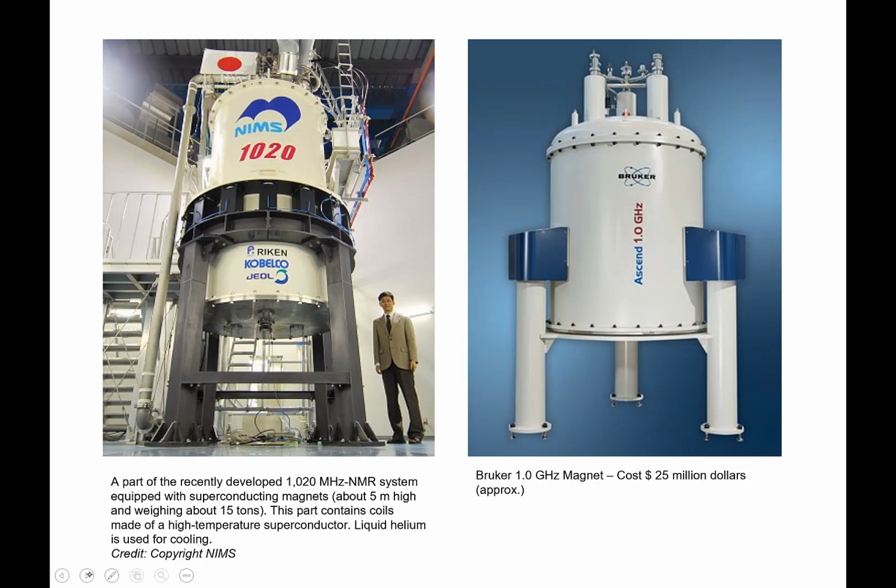So as I was updating my slides, I wondered what the most powerful magnet is on the Earth. And I did some Google searching and found out that basically you can buy one of these. The Bruker company is one of 2 major makers.